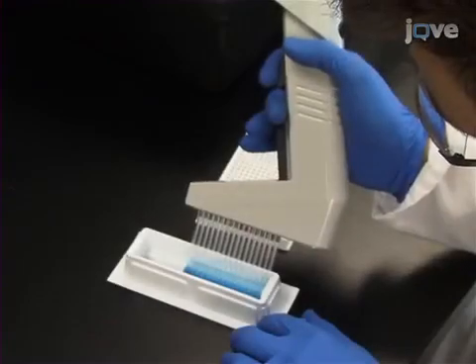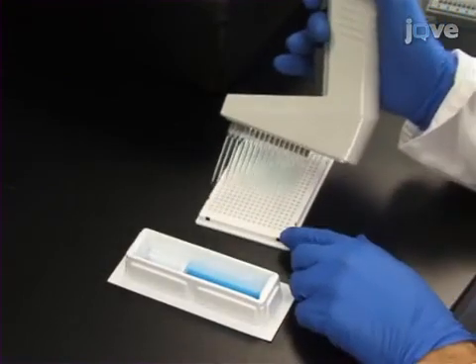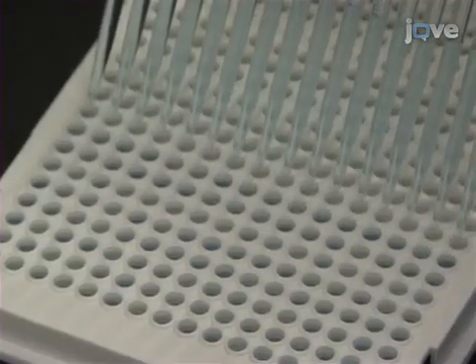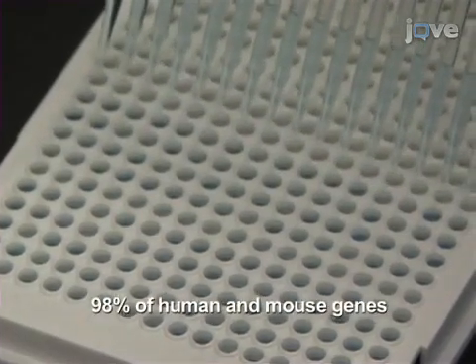The Solaris qPCR assay system is defined by its unique algorithm that utilizes MGB and super-based technologies to provide a single convenient assay for 98% of human and mouse annotated genes.